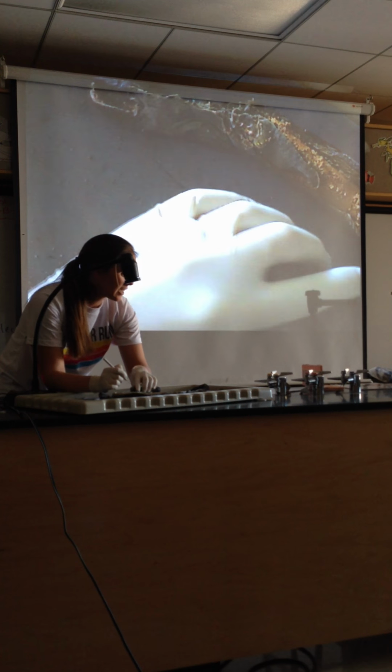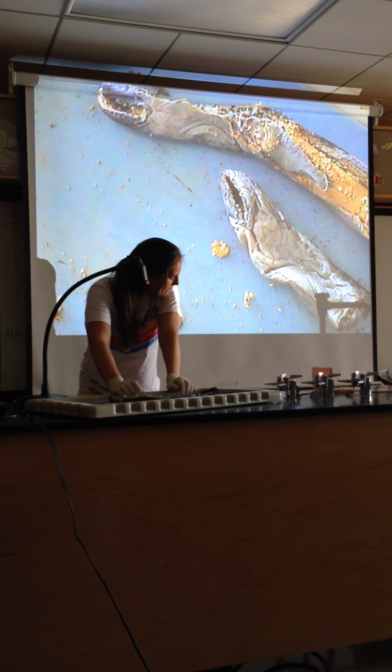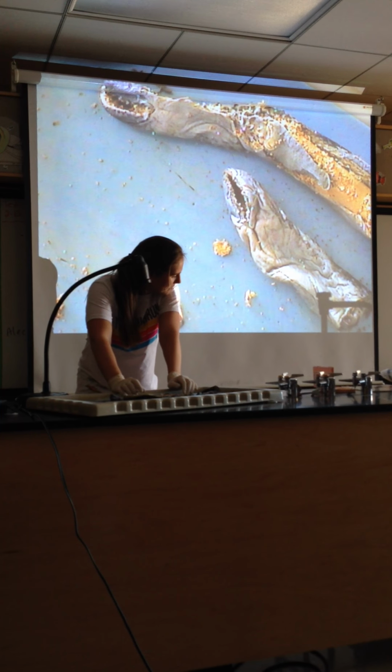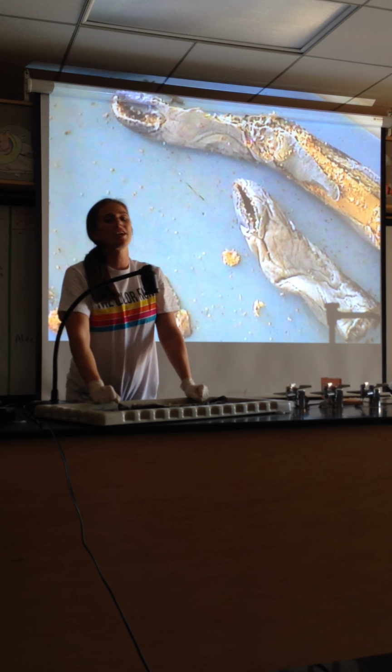All right, that's pretty much everything that you need to identify. Yep, all right, that's good. We got it covered. So I'm going to start handing them out to you.